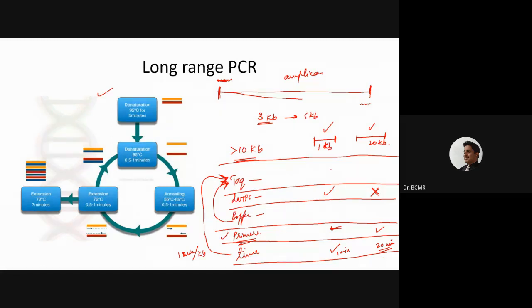Okay, and the Taq polymerase enzyme required is usually fine for both the cases, but in each round of PCR, there is a possibility for some of the enzyme to be degraded, and with each 20 minutes you might have less and less Taq polymerase.